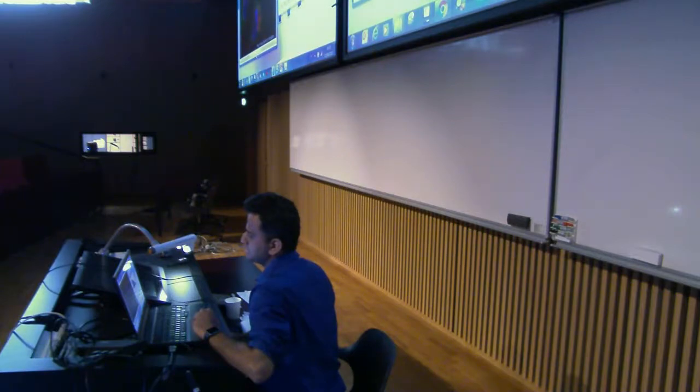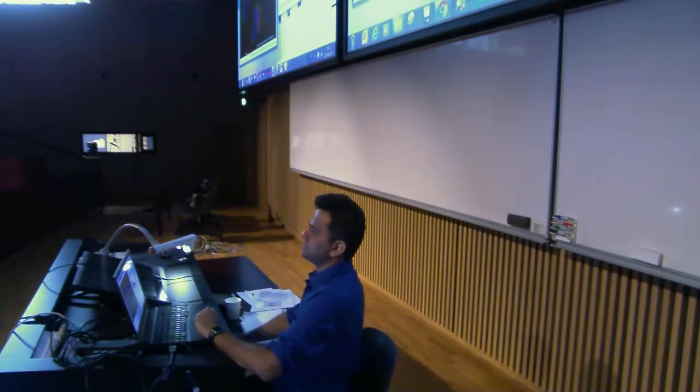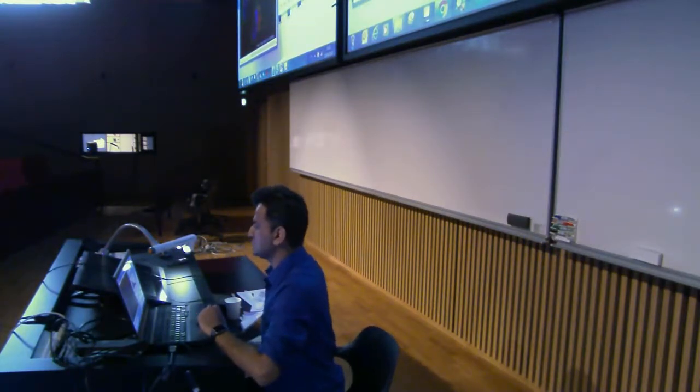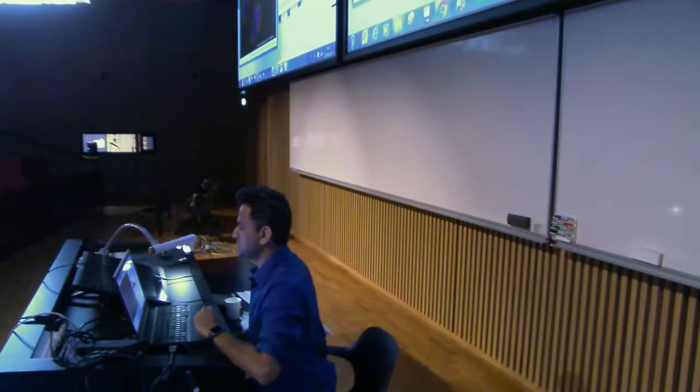For what about the green channel? They are not many. What about the blue one? No, not really. So I should be very careful, and I should go back in acquisition and check the acquisition parameter for the red channel. Okay, this is how you should ensure the quality, because the pixels are saturated.